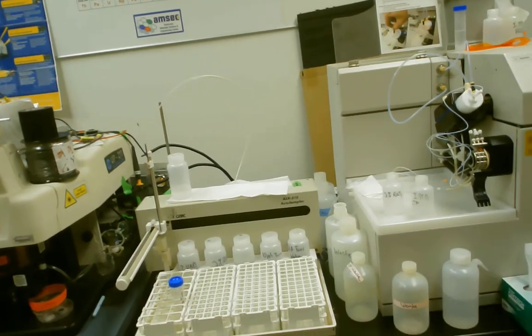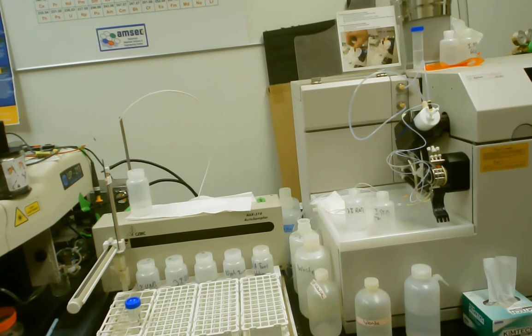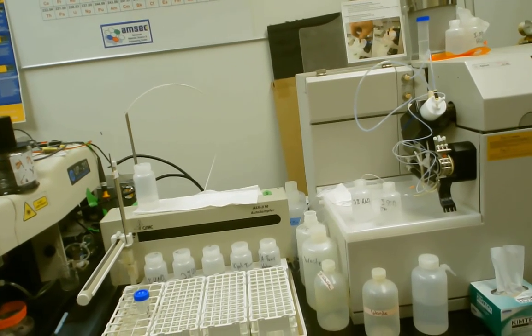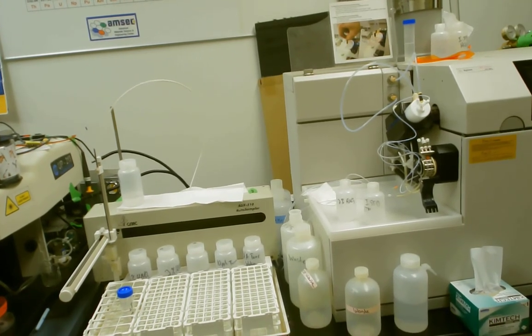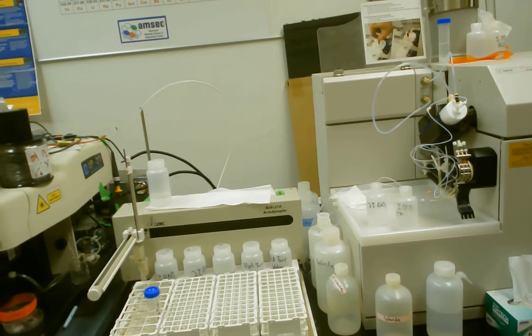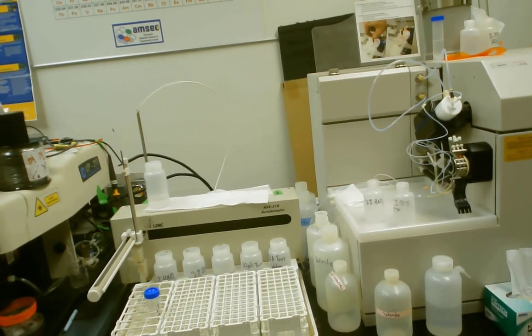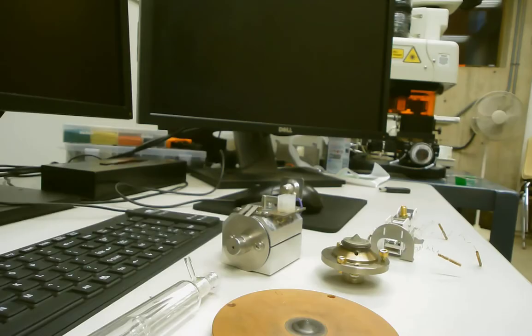Overall, this system operates very well and gives us really good sensitivities. For most elements in liquid mode, we can get into the low to mid parts per trillion detection limits. And for the laser ablation system, we can usually get low part per billion detection limits on most of the elements. So let's take a look at a few of the different parts that I showed you just now, but we have some old, used, or broken versions that we can show you a lot closer.